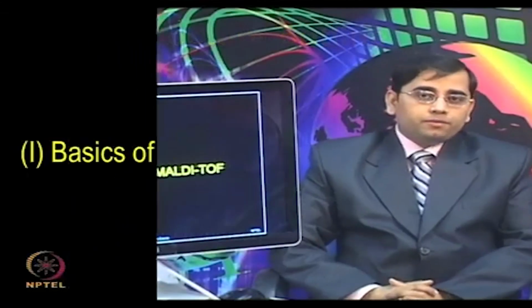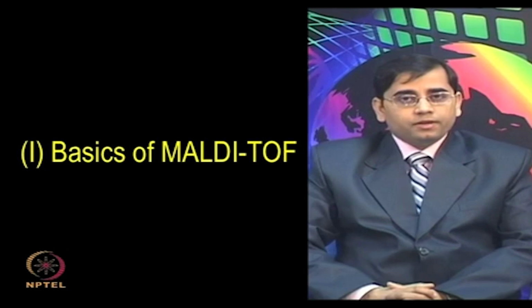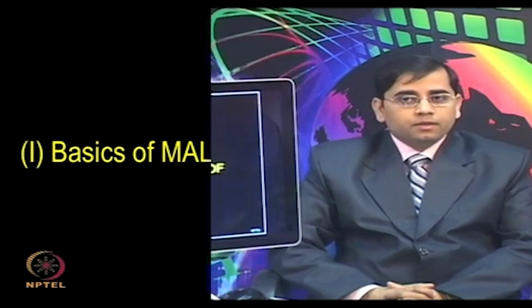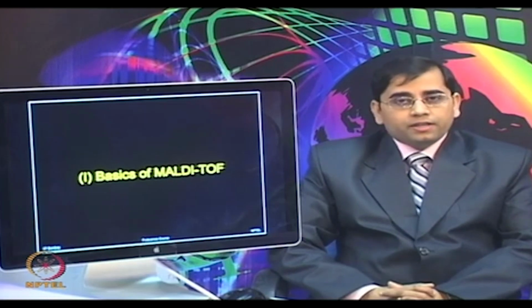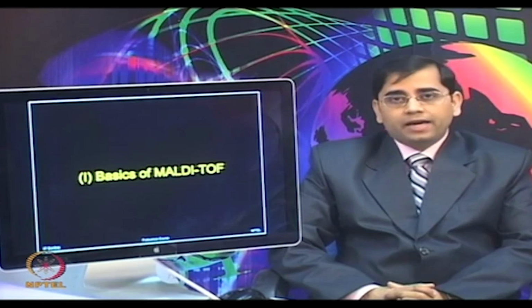Let us first start with the basics of MALDI-TOF. So, MALDI is an efficient process for generating gas phase ions of peptides and proteins for mass spectrometric detection. MALDI is one of the most widely used ionization techniques currently applicable in the proteomics area. This ionization method was independently developed by two scientists, Koichi Tanaka and Franz Hillenkamp. Tanaka also received the Nobel Prize for his novel contribution to soft ionization techniques such as MALDI.